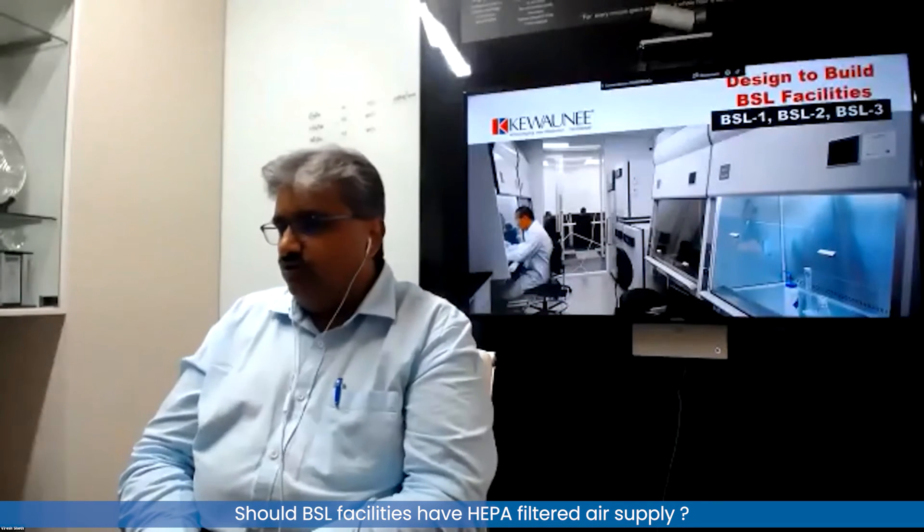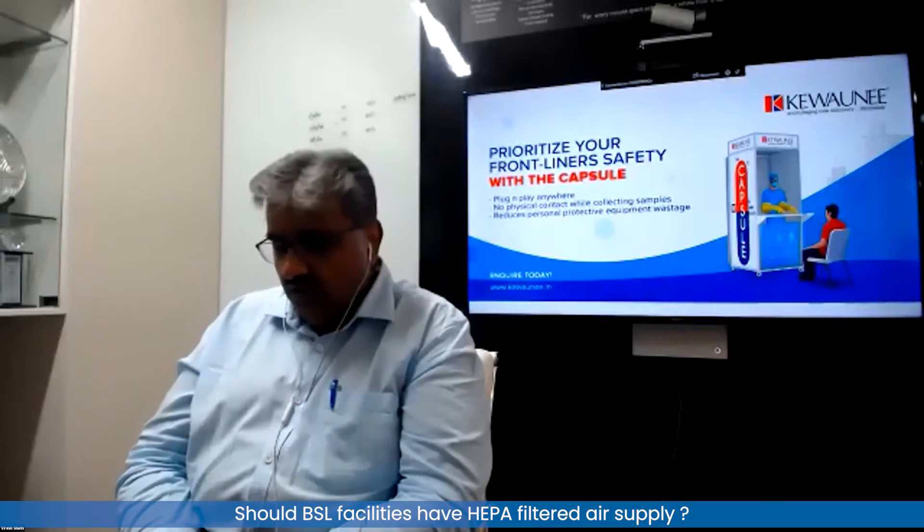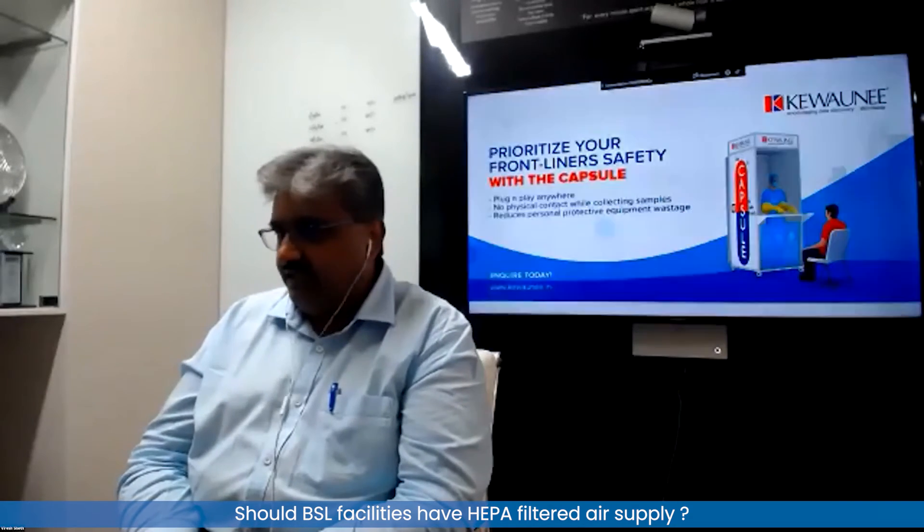We do not know the synergy of two organisms going in, so for BSL3 and BSL4 it is good to have HEPA-filtered air inflow. In the case of BSL1 and BSL2, it is not necessary.